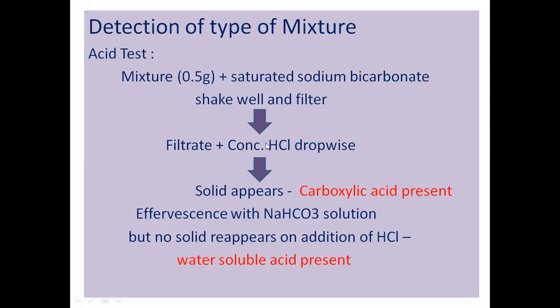Now we are adding concentrated HCl to regenerate that acid. So the filtrate contains the COONa group. When you add concentrated HCl, that Na gets replaced again by H, and NaCl will form. You will not see it, because it is a salt, it will get dissolved in the water. Then if the acid is present, when you add the concentrated HCl to the filtrate, you will get the solid. That solid means what? That is the acid. We are doing regeneration.